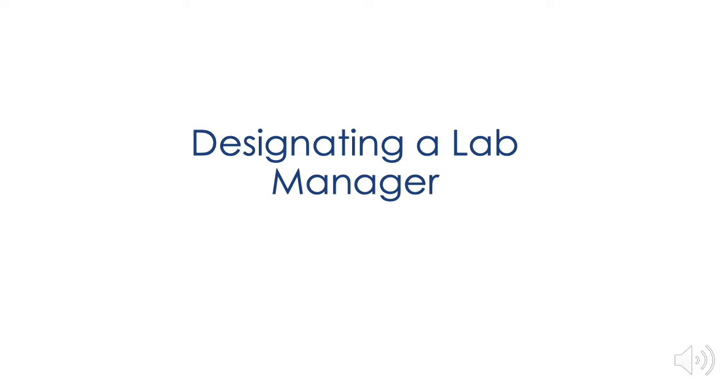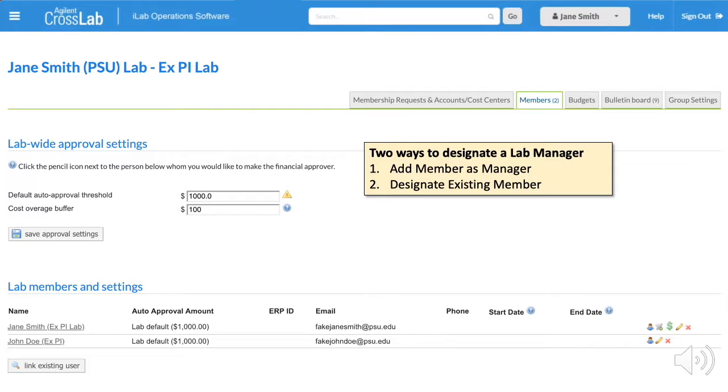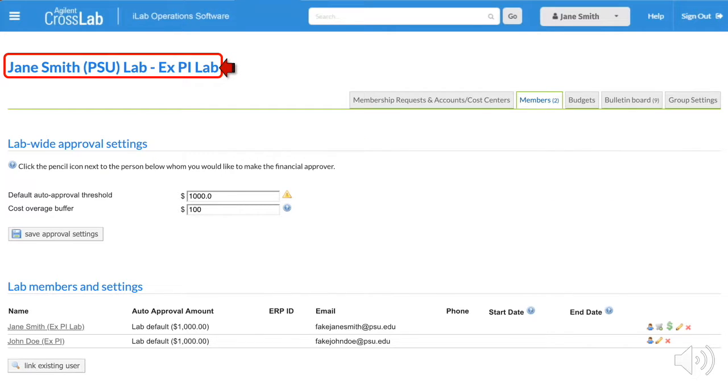Welcome! In this video, we will walk through designating a lab manager to help you manage your group within iLab. There are two ways to designate a lab manager for your lab. The first is to add a member as a manager. The second is to designate an existing lab member. For this example, we will be the PI, Jane Smith.